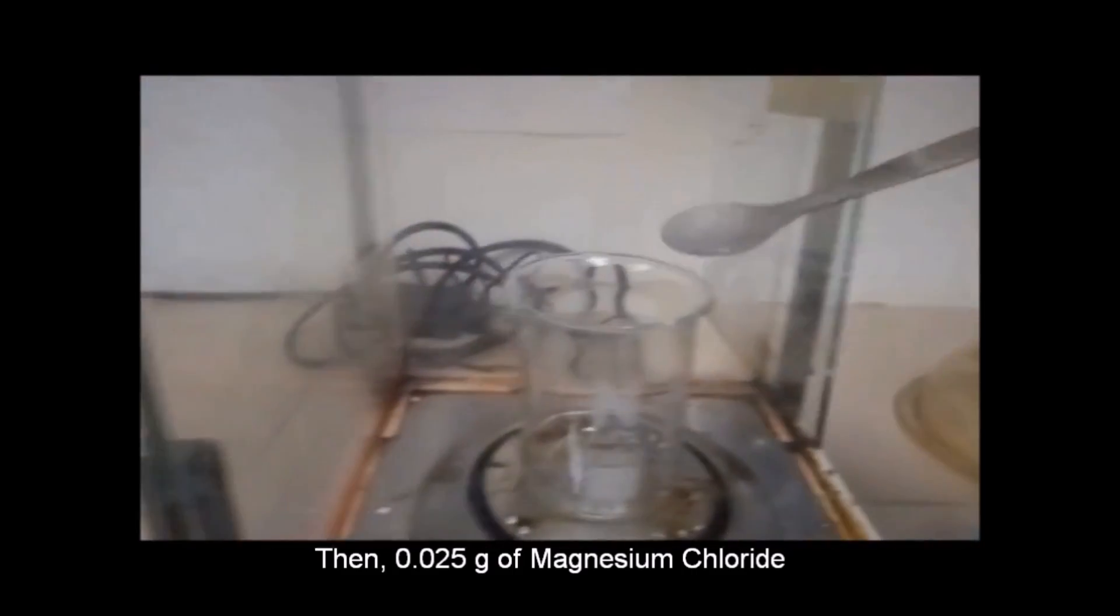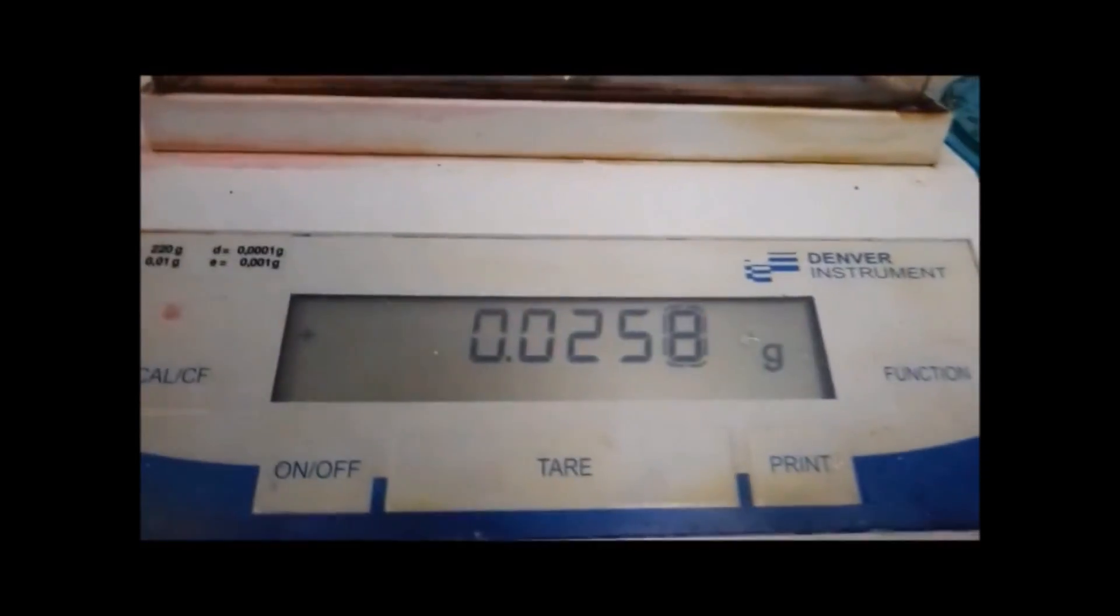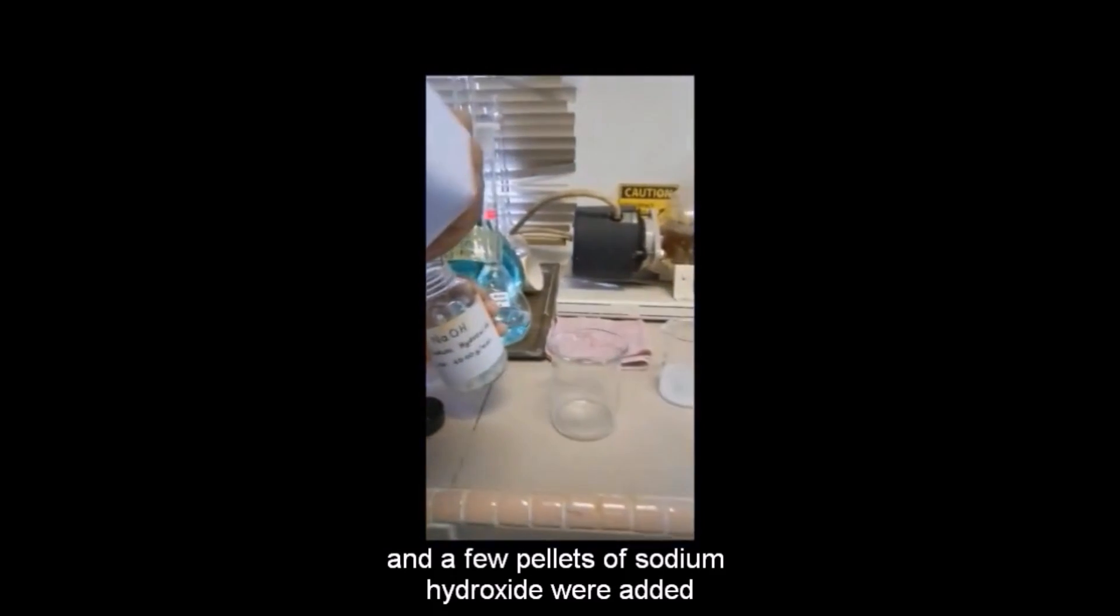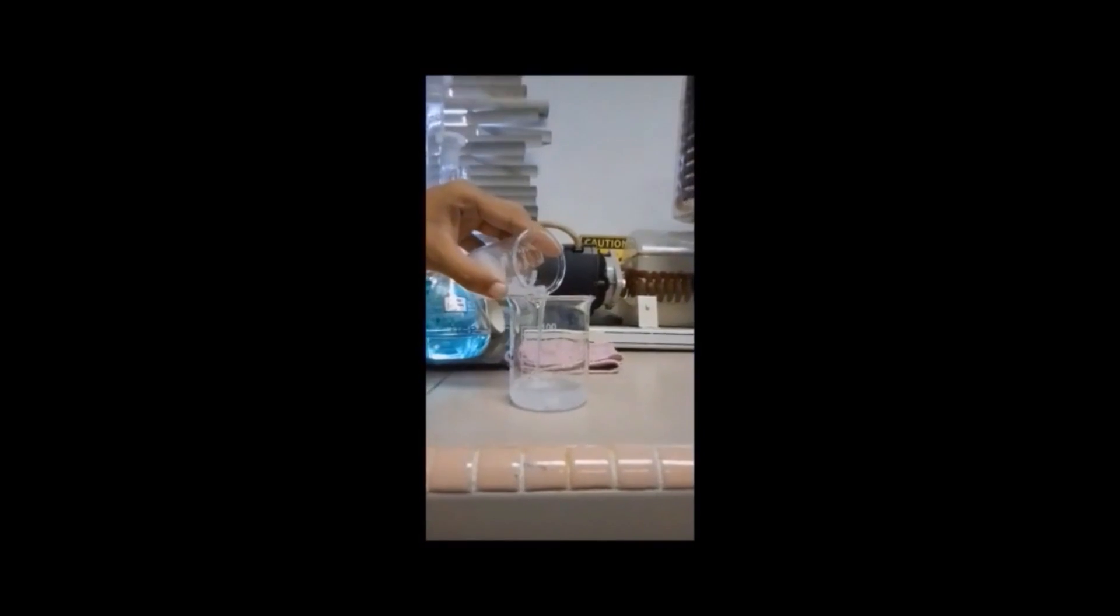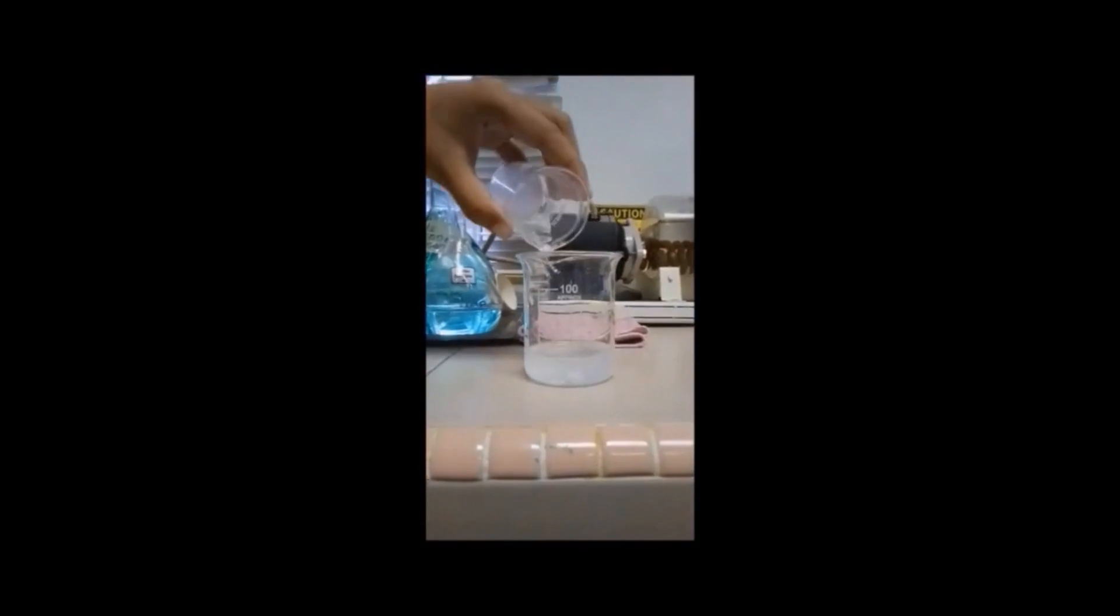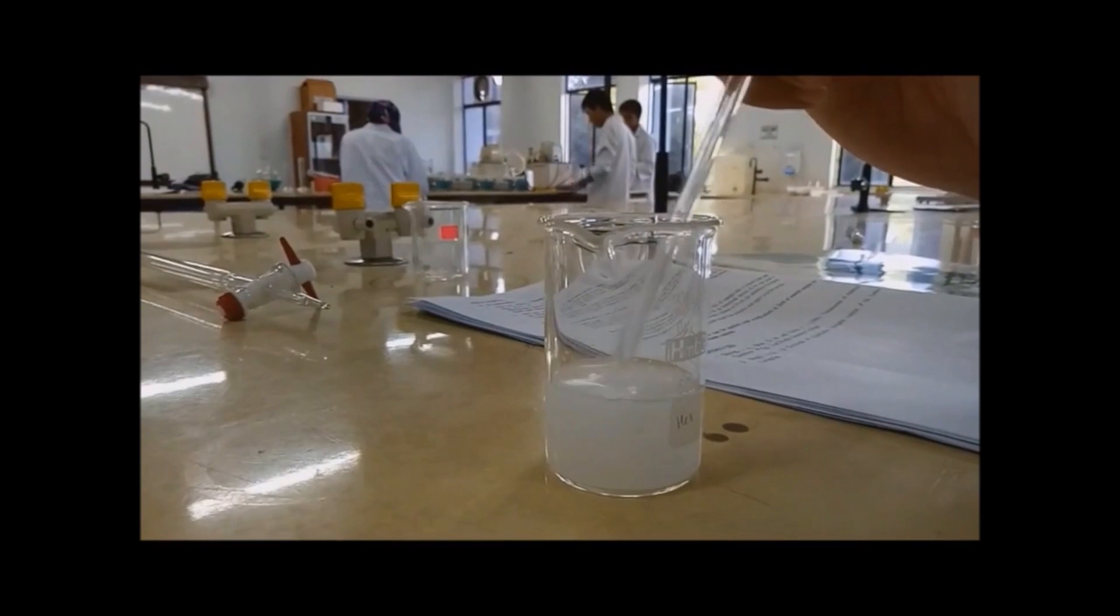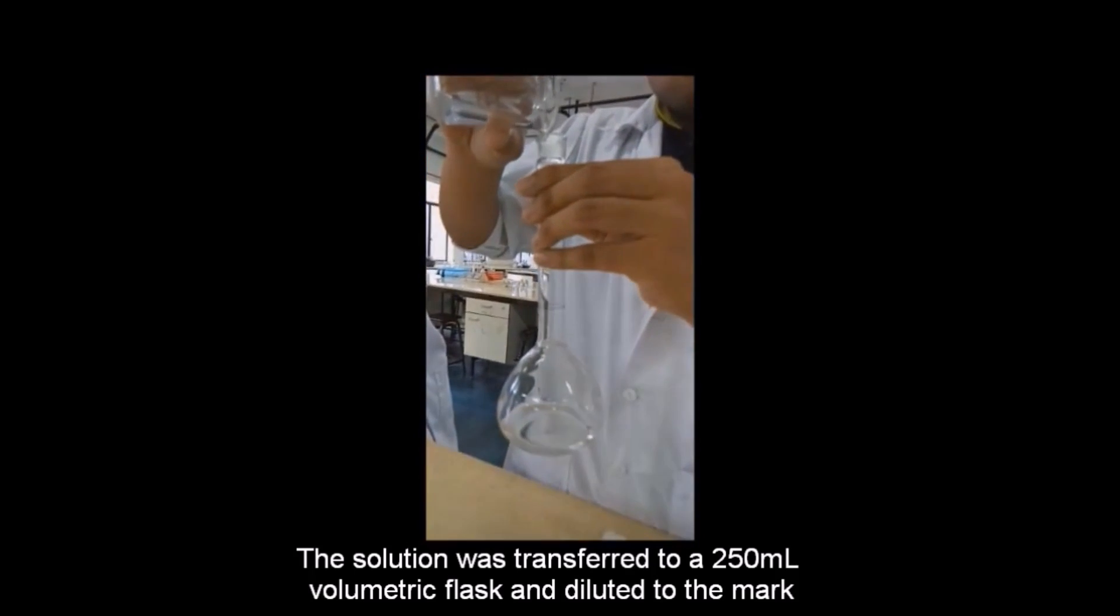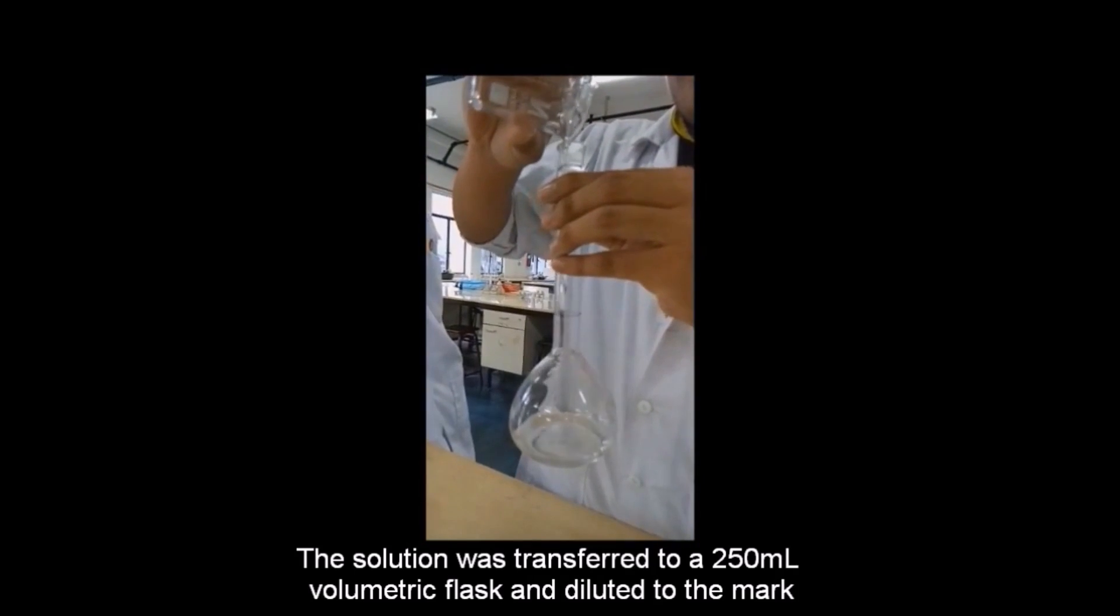A few pellets of sodium hydroxide were added. The solution was transferred to a 250 ml volumetric flask and diluted to the mark.